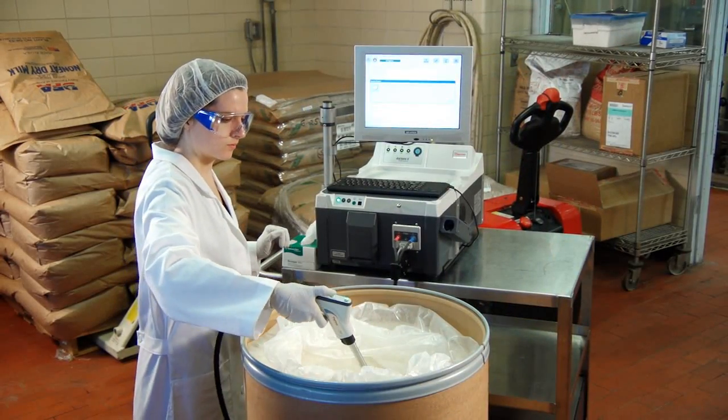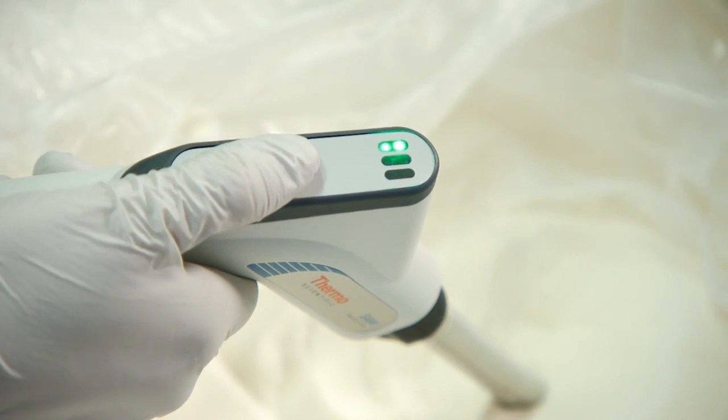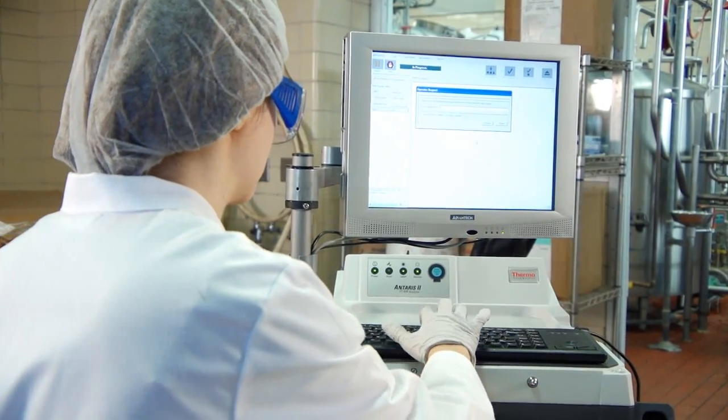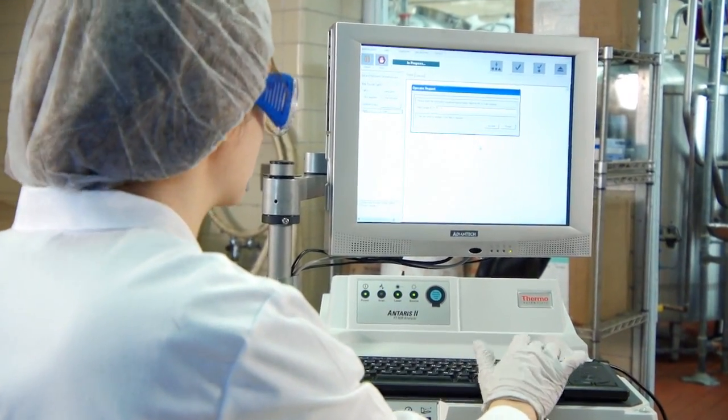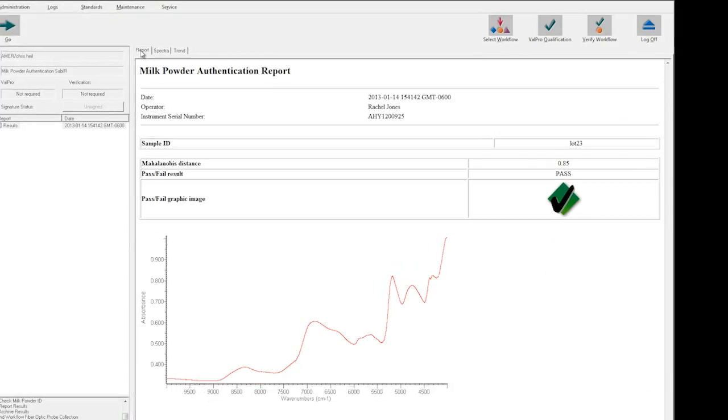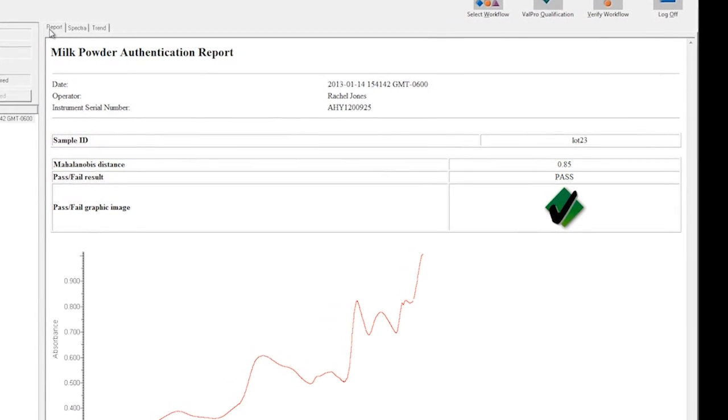Raw material qualification is as easy as the press of a button with a Thermo Scientific SABE-IR fiber optic probe. A workflow is automatically executed with predefined parameters that collects the spectrum, runs an identification algorithm, displays conclusive pass-fail results, and automatically reports and archives results.